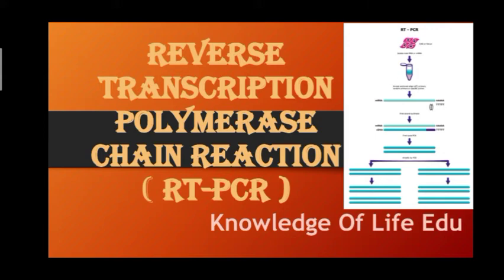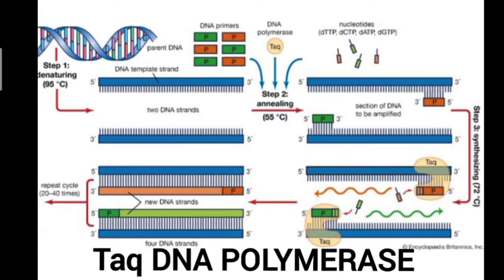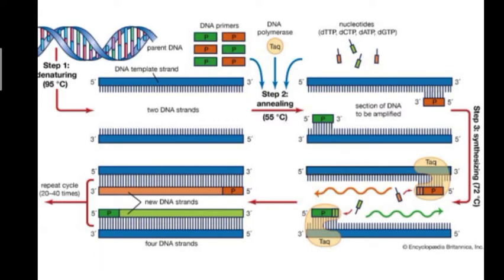So we are using PCR to generate copies of DNA. It has unmatched applications in genetics and genomics research. Using the Taq DNA polymerase, DNA synthesis occurs in conventional PCR. The Taq DNA polymerase recognizes the binding site or substrate.